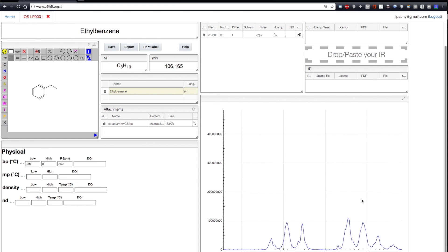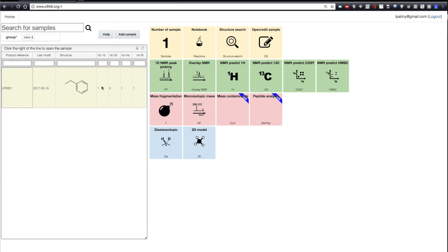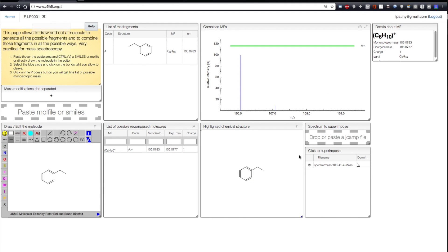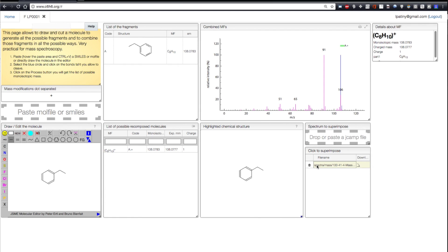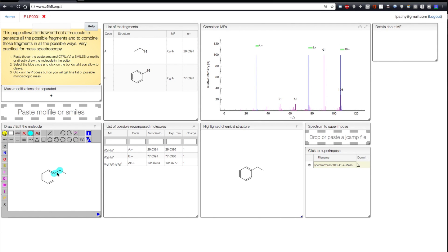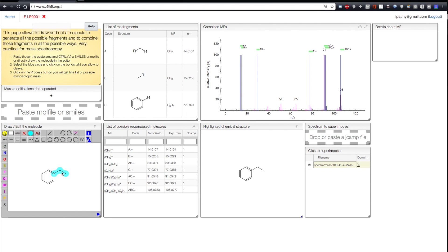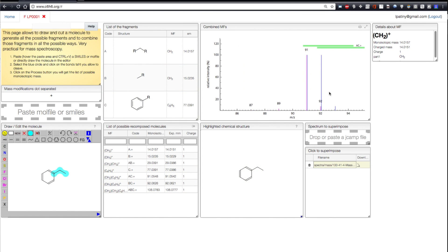This is a real spectrum. You can zoom in and process it. An example of extra tools is the tool that allows fragmentation analysis, so you can superimpose your experimental spectrum and then fragment the molecule. You will see all possible fragments and compare them to the experimental spectrum. In this case, we will see, for example, that the benzyl group is the main fragment of this molecule.